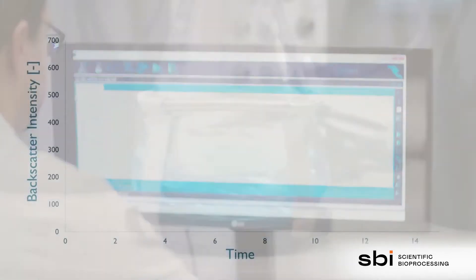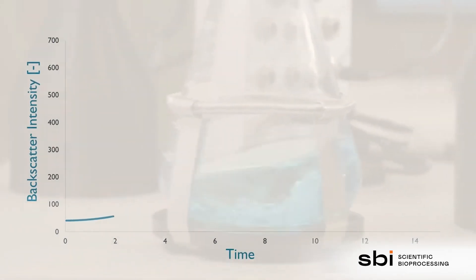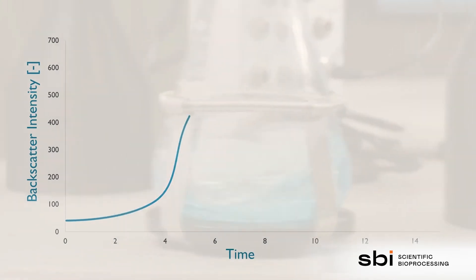By using the CGQ, you can now follow the growth of your cultures in real time without taking any samples. Up to 16 cultivation vessels can be monitored simultaneously with an unmatched resolution.